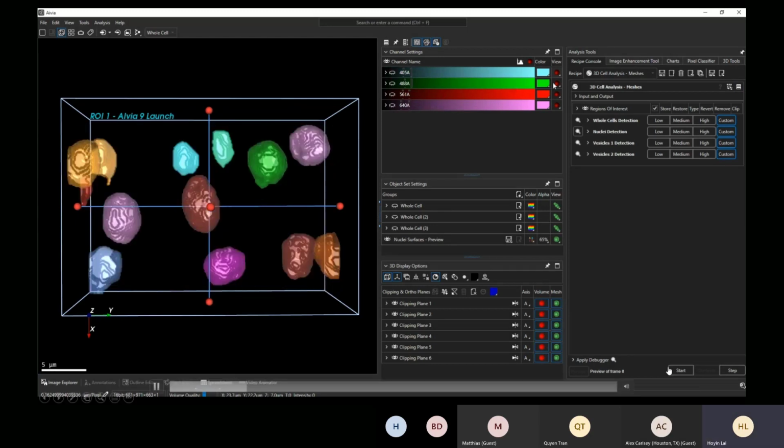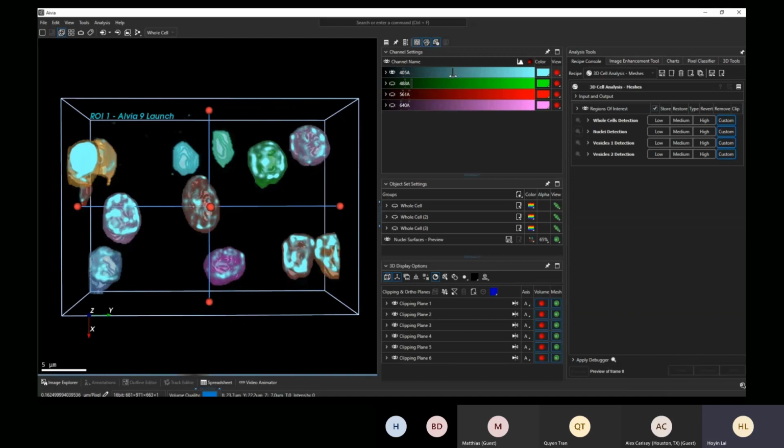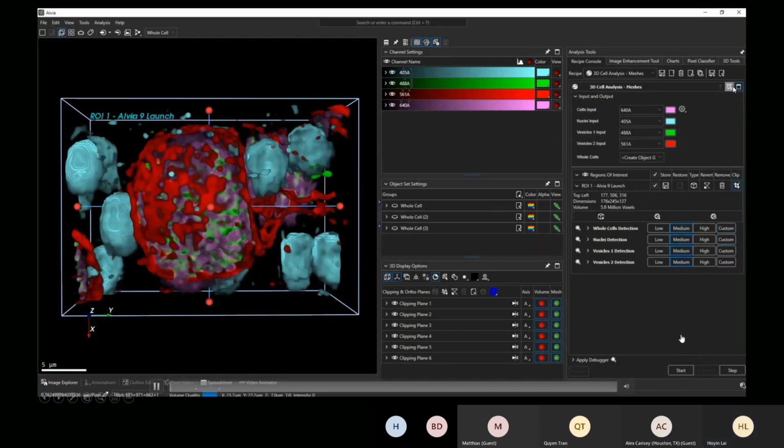Let me just skip right past this one, because this video is showing a lot of the visualization options that we have in Avia. Okay.